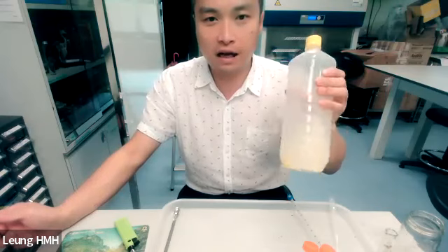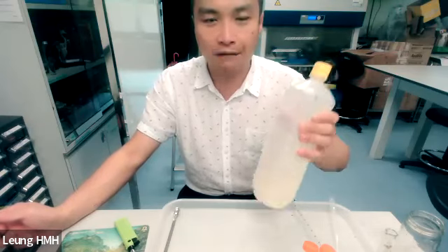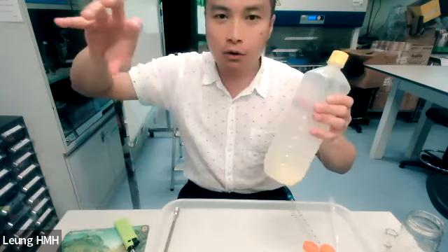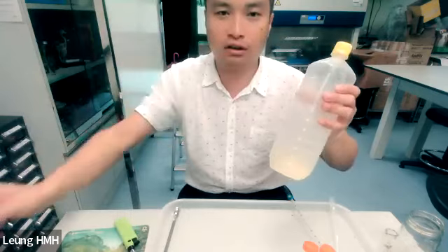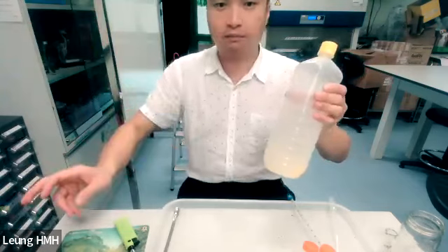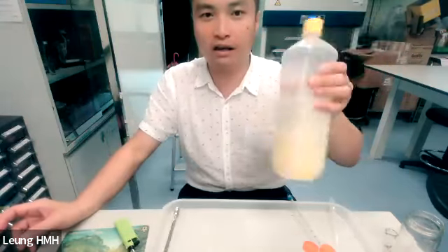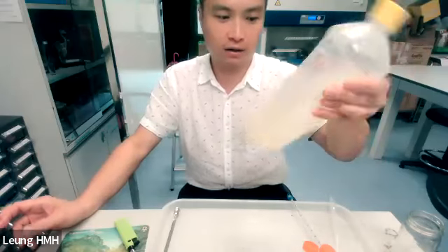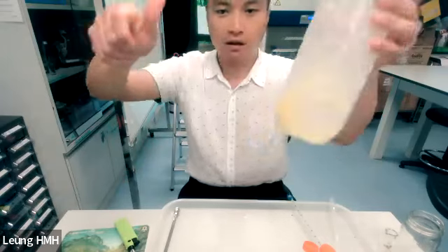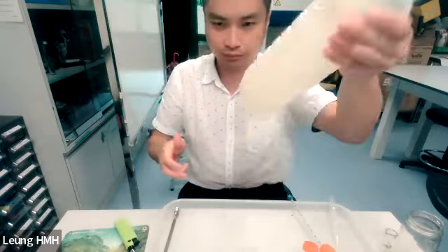So if water is present in the biodiesel product, I think your car will be knocking, right? That means the diesel will combust very roughly. So you may find it not comfortable when you drive the vehicle, right? Okay, so we try to release the gas, and then repeat the procedure, right? Repeat the procedure.